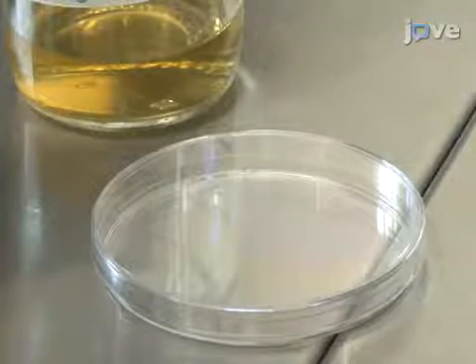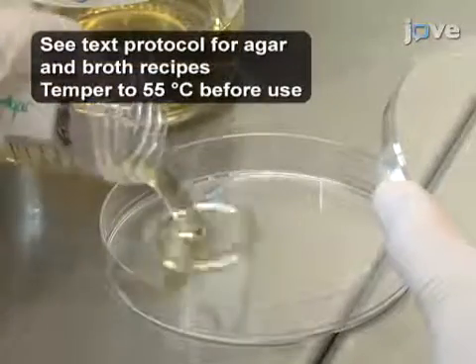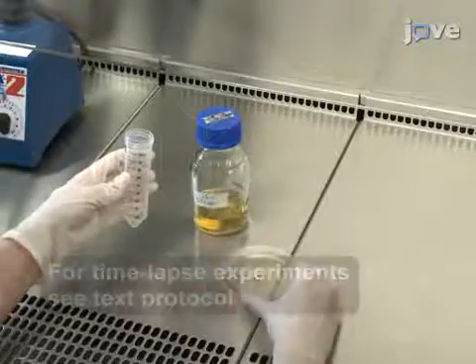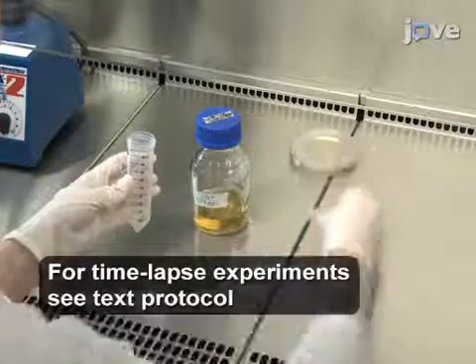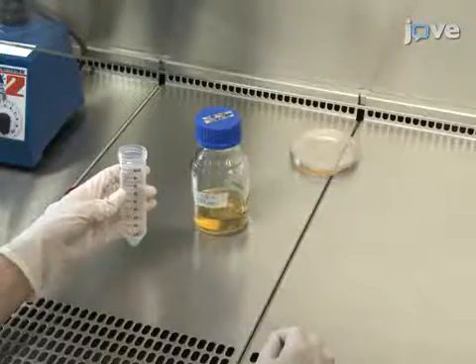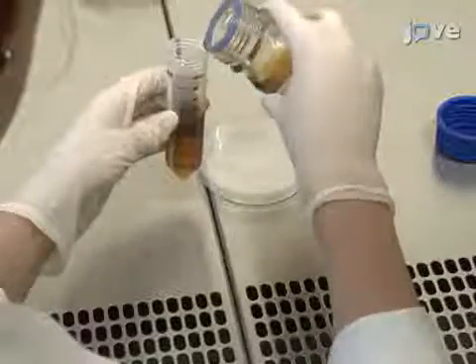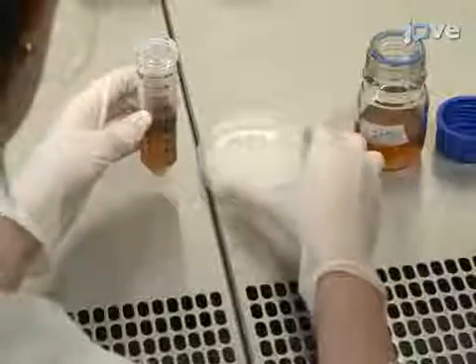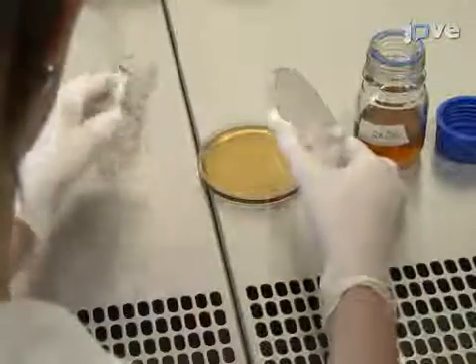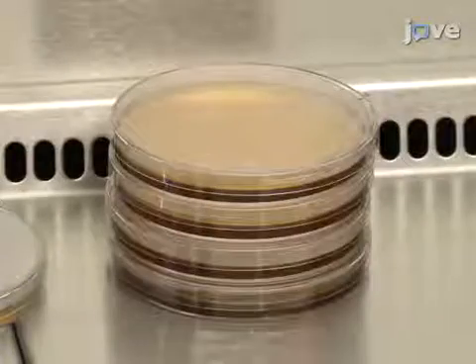To prepare plates for swarming and sliding experiments, pour 20 milliliters of tempered LB medium into a 90 millimeter polystyrene petri dish. Close the dish immediately and then place it to one side of the sterile hood to cool for at least 1 hour. Next, prepare plates for colony biofilm experiments by pouring 25 milliliters of agar 2xSG medium into a 90 millimeter petri dish. Close the plates immediately and set them to cool in stacks of 4 or less for at least 1 hour.